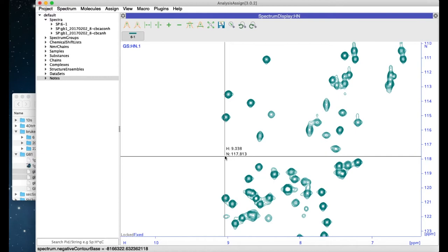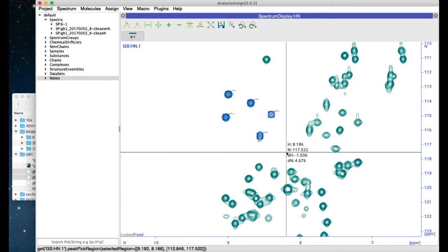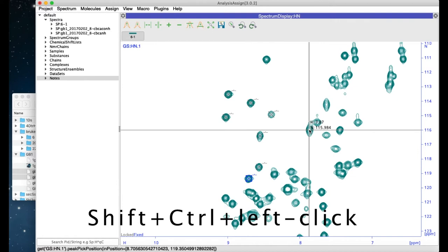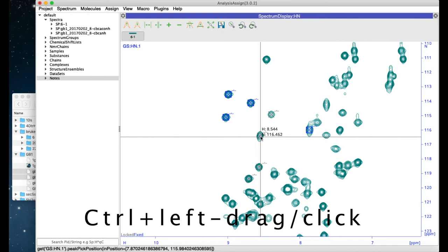You can pick peaks by dragging the mouse and holding down the Shift and Control buttons, or simply hold down Shift and Control and click to place a peak manually. You can select peaks by holding down the Control button and dragging or clicking to add or remove peaks to the selection.